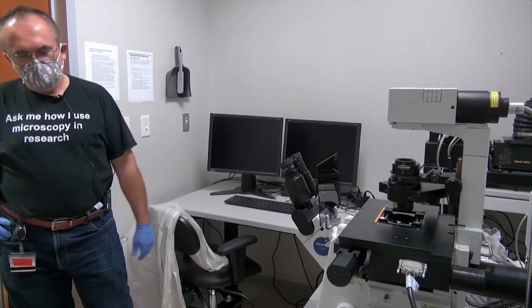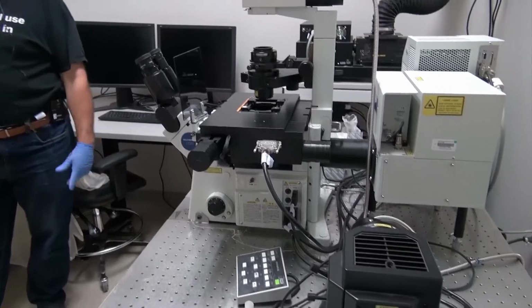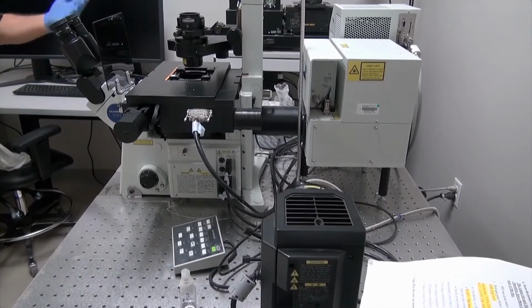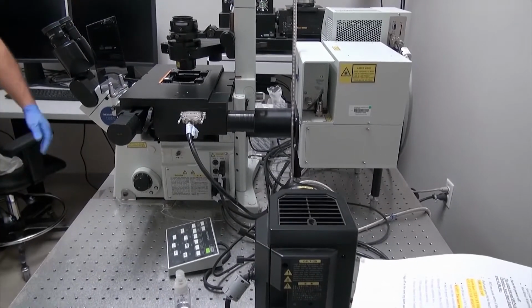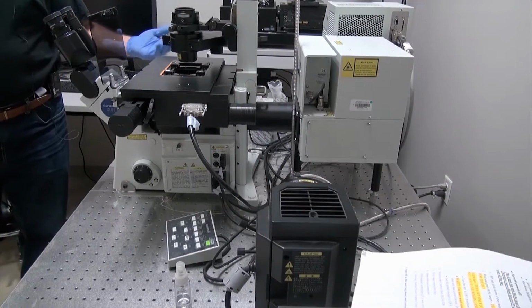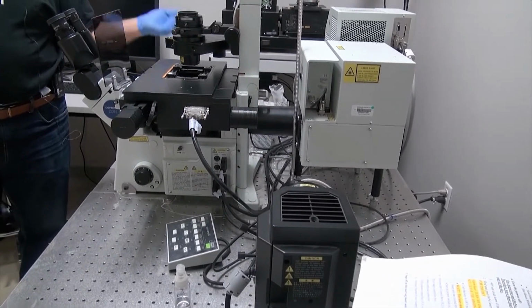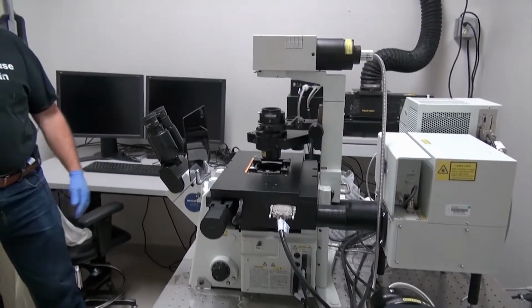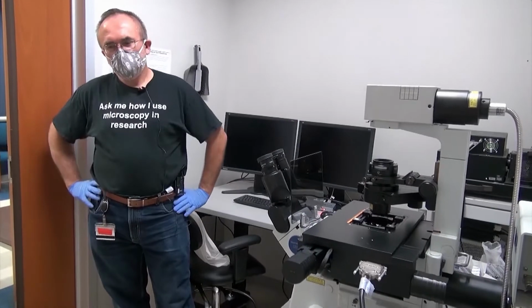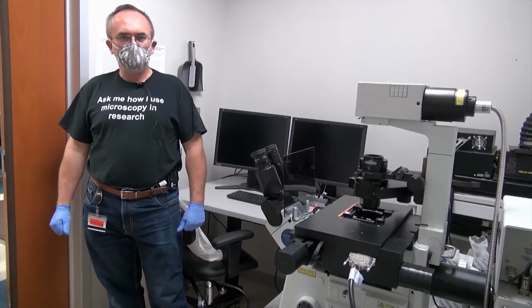So this microscope is used for imaging of either fixed or live samples that are biosafety level 1. And in addition to the regular mode of operation, we can also use the motorized stage to image multi-well plates or multi-well slides. And we also have the SIM scanner, which is an accessory that allows photoactivation or photobleaching at high temporal resolution.